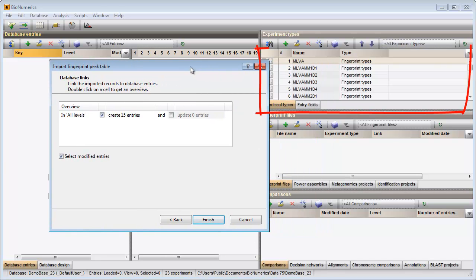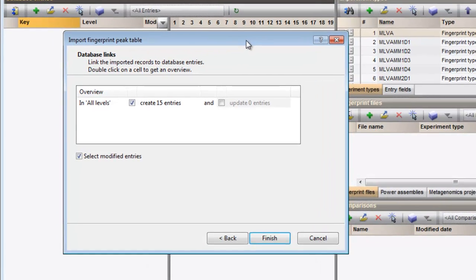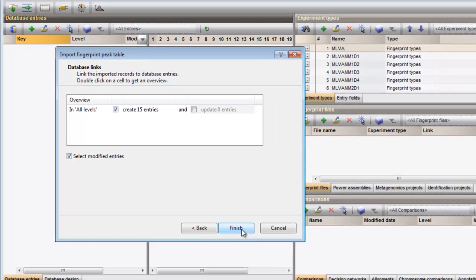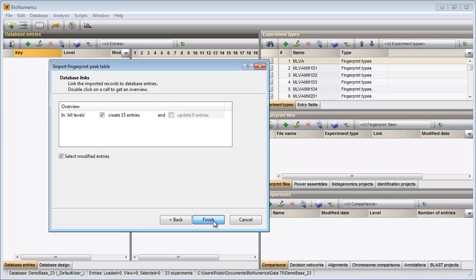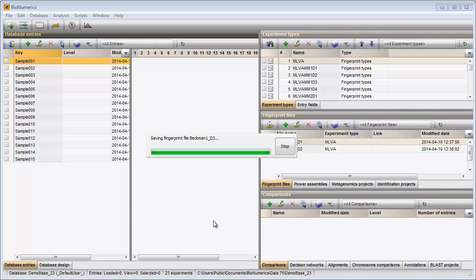The new fingerprint types are added to the experiment types panel. A linear reference system between the maximum and minimum fragment length positions is created for each fingerprint type experiment. The import routine checks if the keys are already present in the database, and if not, new entries will be created. A fingerprint file is created per imported die. The individual lanes are assigned to their appropriate fingerprint type and linked to the corresponding entries.